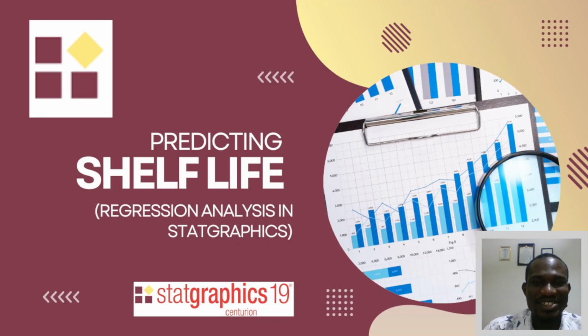Statgraphics 19 Centurion to analyze our data for shelf life analysis. Shelf life is very important in many industries: food industry, pharmaceuticals, cosmetic. All these production industries need to know how long their products can stay on the shelf or can stay in any condition that it is given.